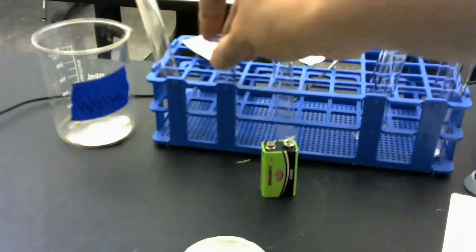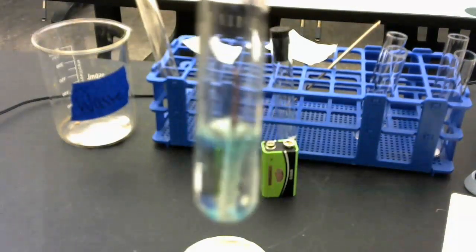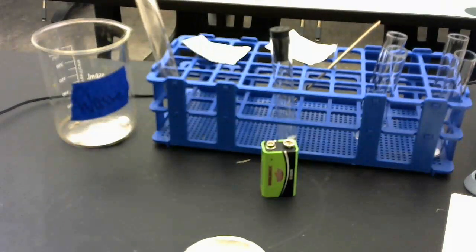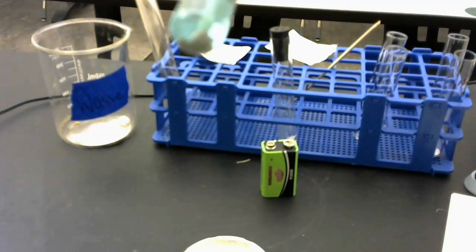And I'm going to come back to my silver, because here's my silver nitrate, and you can actually see I'm producing copper nitrate, and hopefully you can see this. Maybe if I gave you a white background, you can see that there is a blue hint, a blue color that's being produced. And that actually is your copper nitrate. And then as I shake it, what ended up happening on the bottom here, if you can see, you have those solid silver particles right there.